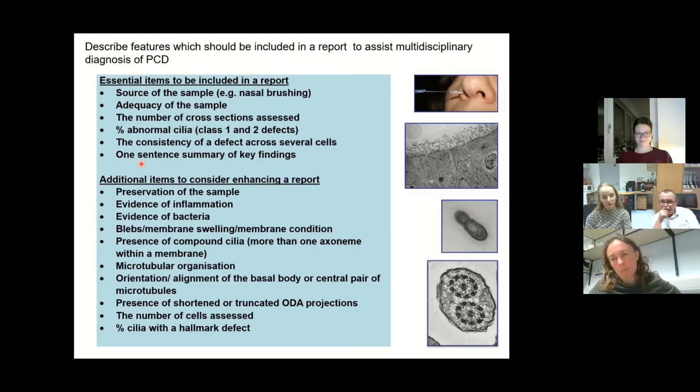Write down the opposite of not enough detail: lots and lots of detail. And then other things, which I think I've probably covered in the talk, which are useful to enhance a report.